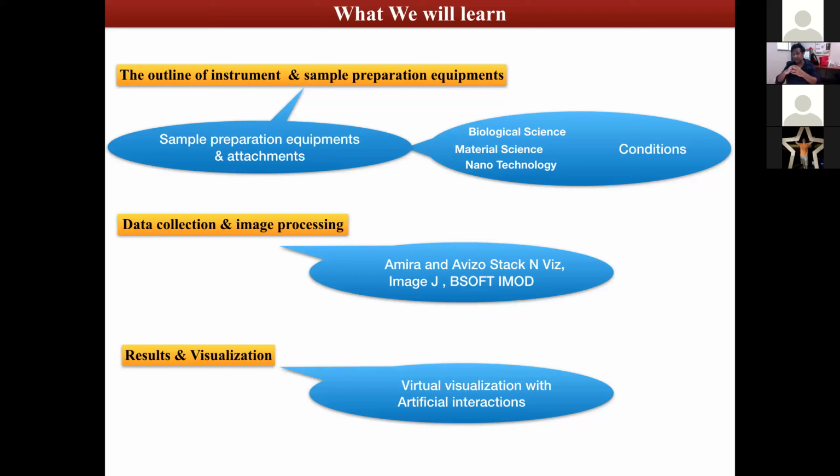Additionally, there will be what we call a pair of goggles and a hand controller. You will put on the goggles, and with the hand controller, you can literally see the whole density map in 3D. And you will be able to control the density map using that hand controller. We like to call it an artificial intelligence system. So Dan Gostovich of Thermo Fisher says that this is the first Helios Cryo Dual Beam with artificial intelligence in it. So if you just go by the terms, we are the first in that case.